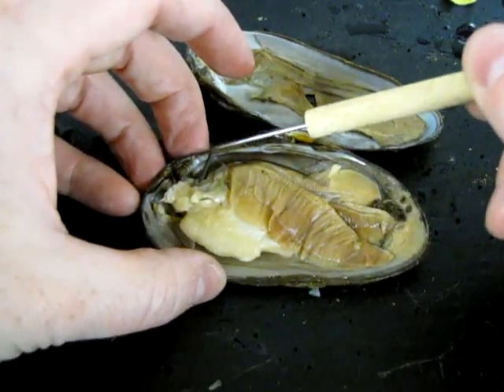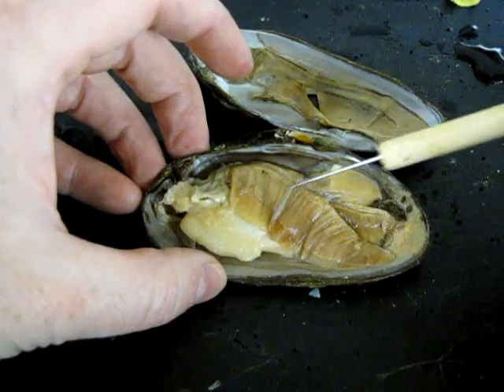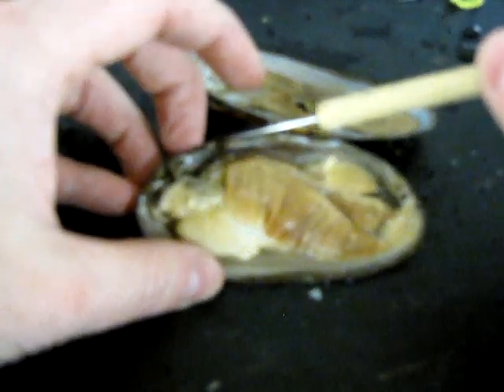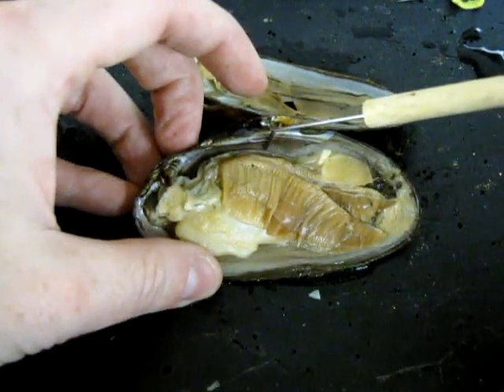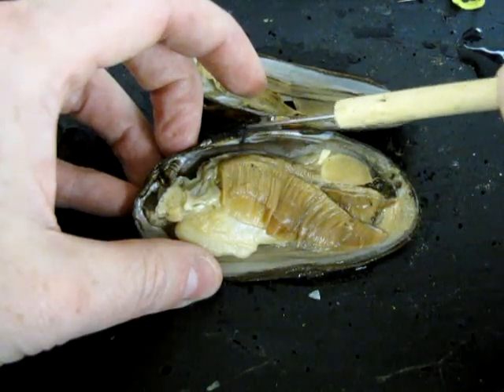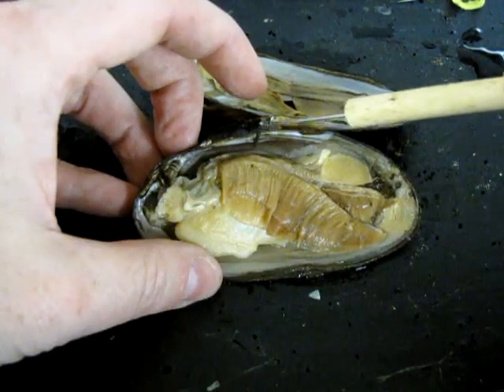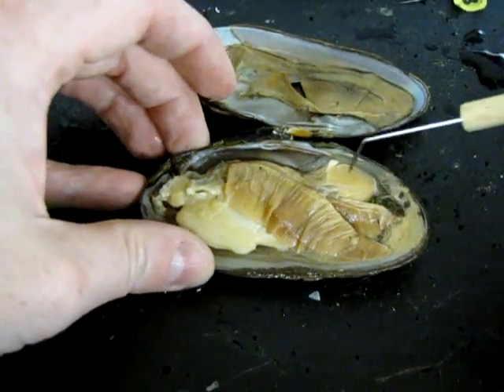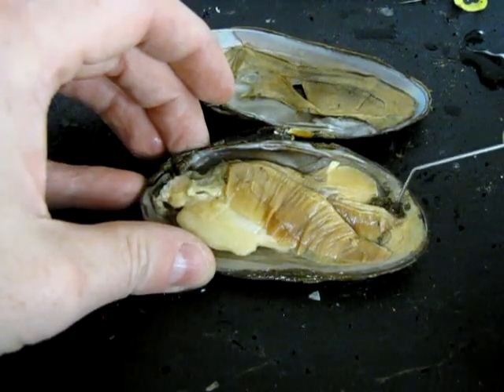Food enters through the mouth, passes into the stomach in the visceral mass, then through the intestines in the visceral mass. The intestines come up to the dorsal surface of the animal and pass along the dorsal area through the heart. The heart is housed in a small area called the pericardial cavity, covered by the pericardial membrane. The intestine passes through the heart, carries along the dorsal surface, and then becomes the rectum and anus through which waste is ejected.